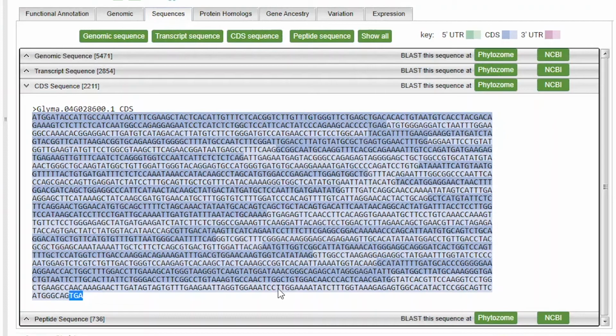So this sequence here is really the starting point for any lab cloning project. If you decide to join a research lab on molecular biology sometime in your professional career, you'll likely be asked to do something like this: find the sequence of a gene, because you need it in order to study it, right? So there you have it.